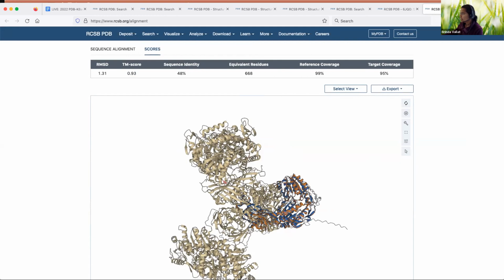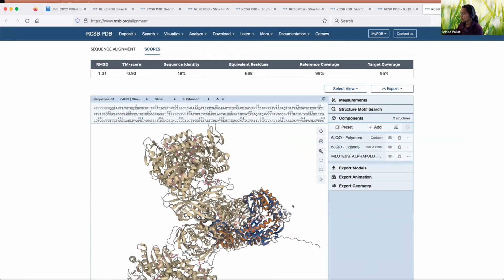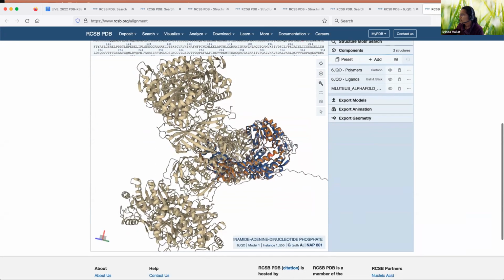And now there are ligands, small molecules present in the E. coli enzyme. We already saw that. So now you can focus on these ligands using the Mol* tool. Nishuchi will explain in more detail about how to use the tool, but I just want to quickly highlight how you can get some structural and functional insights using the tools in rcsb.org. So now you can focus on the ligands, and there are ligands in the aligned regions here, the crotonyl coenzyme A and NADP.